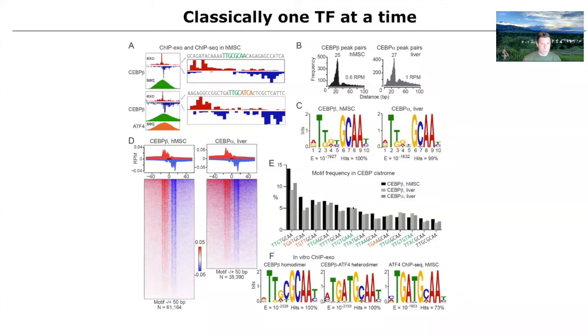And this is all very busy. It's just another example that you can do this for RNA-seq, ChIP-seq, or anything, where you sort of set a position and then say, what's the trend of every observation as a row here. You're kind of averaging the data in a way.